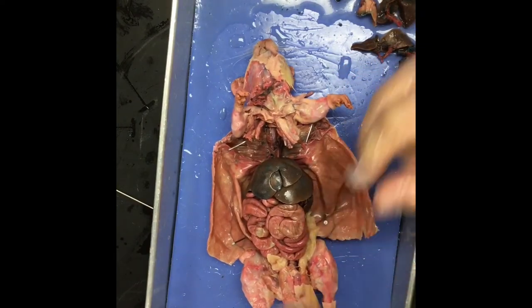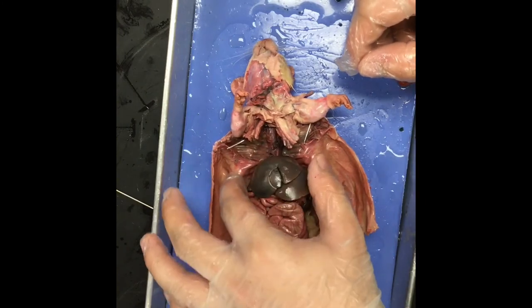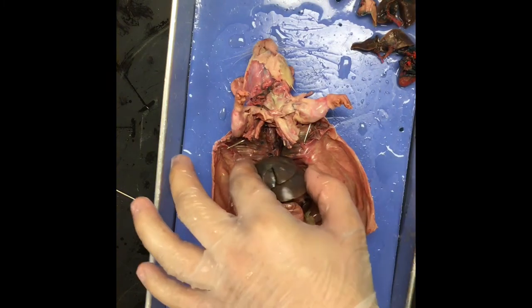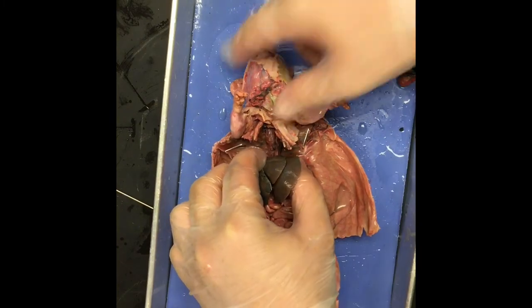So, the first part, this is going to be the liver. It's right here on the top. That's big. Now, it is a massive liver compared to ours. Why do you think that would be? Because they eat a lot of food out of trash cans. Rats eat everything. They need a good liver to process that stuff. Again, very carefully remove it.